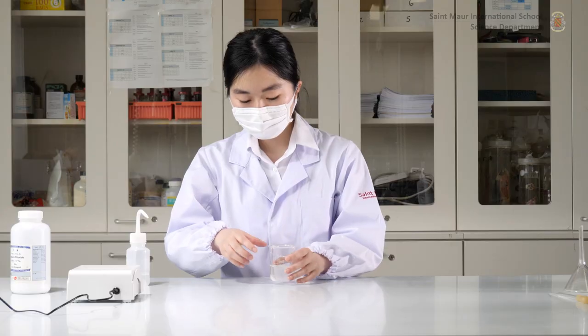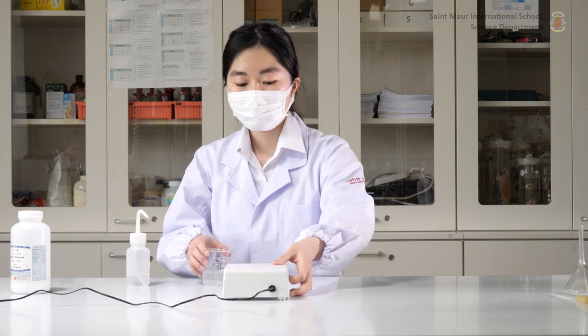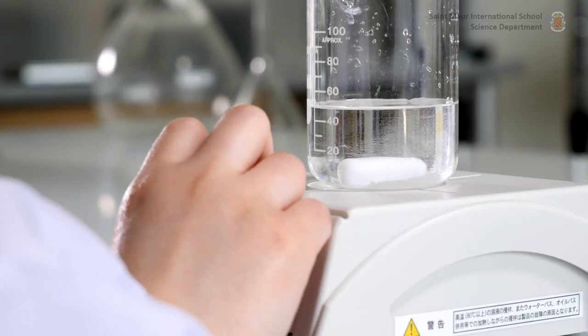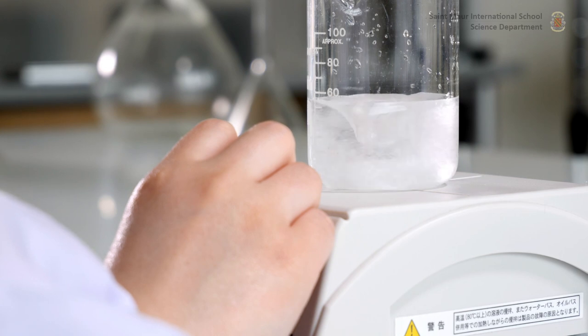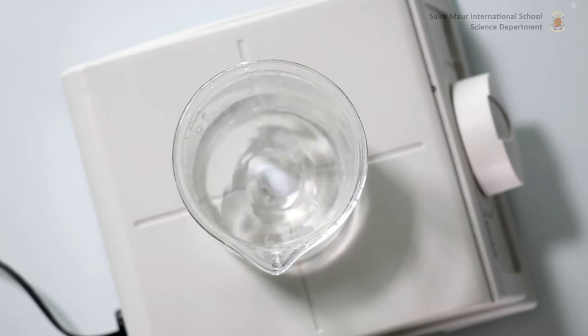Add a magnetic stirrer into the solution and mix until all the solute has been dissolved. Note that some magnetic stirrers also have a heating function which can be used to further speed up the process, depending on the solute and solvent used. Start the rotor at minimum speed and increase it slowly to prevent the magnet from popping out of the beaker.